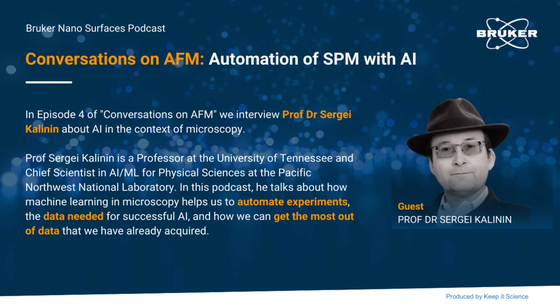So I believe that in the near future, we can have AI agents that will operate the instruments at the level of a beginning or average trained operator. So they can be used to train beginning operators on the long-term dream, pressing the button, and then the microscope starts to work. They can start to give their performance at the level of a mid-level operator.